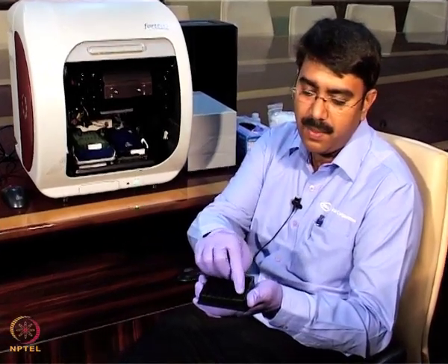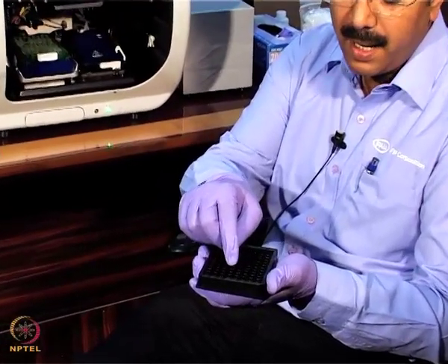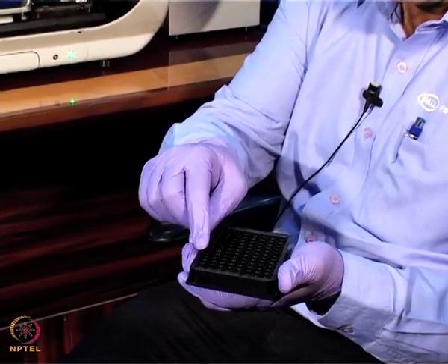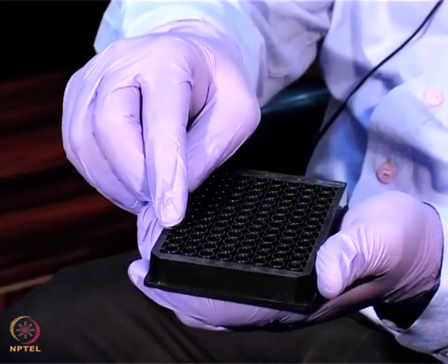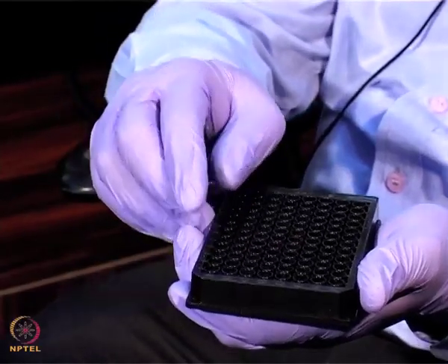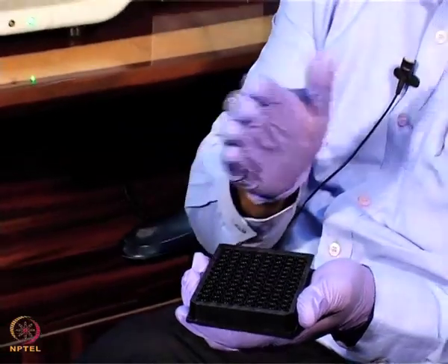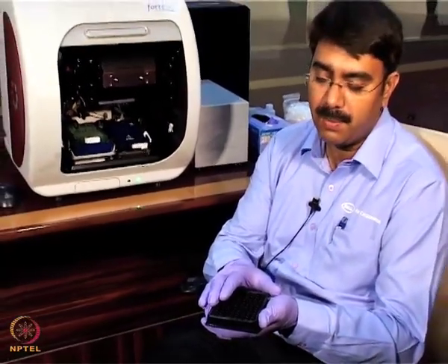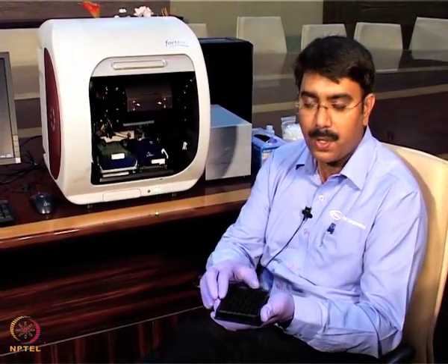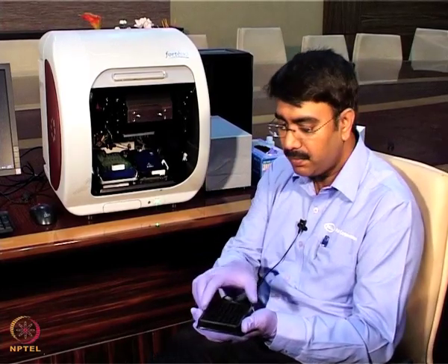This is the buffer, the first column, and in the second column I am going to put the 10 micrograms per ml concentration of biotinylated protein A, and in the third column I am going to put buffer. It will be useful for washing off unbound biotinylated protein A, and this well I am going to use for the dissociation step. And the last wells I am going to put the analyte, that is 25 micrograms per ml serially diluted across all these 6 wells.